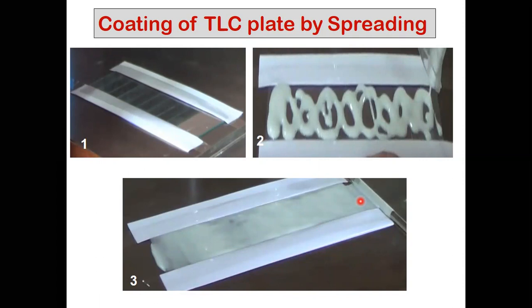These TLC plates can be used for analytical studies to identify the components of mixture and also to check the purity of the sample. It is very important to note that always use forceps to handle the TLC plate or do not touch the silica layer of the TLC plate. Otherwise, it can cause damage of the stationary phase and also can cause contamination.